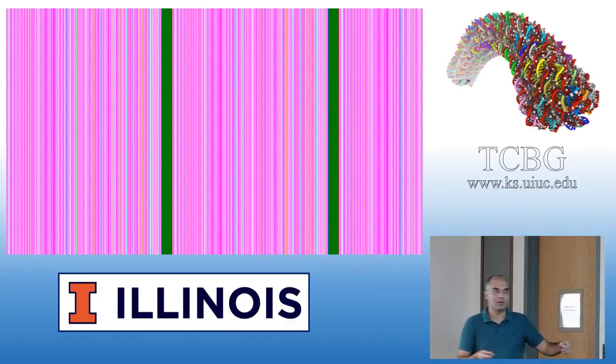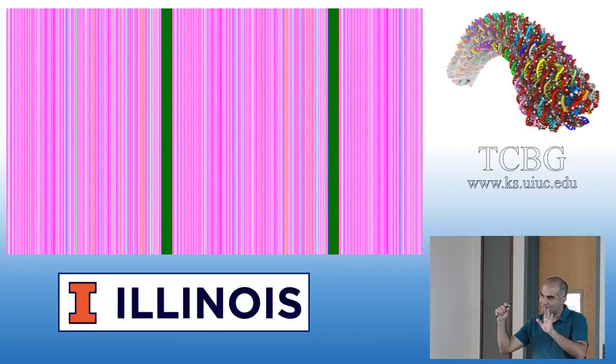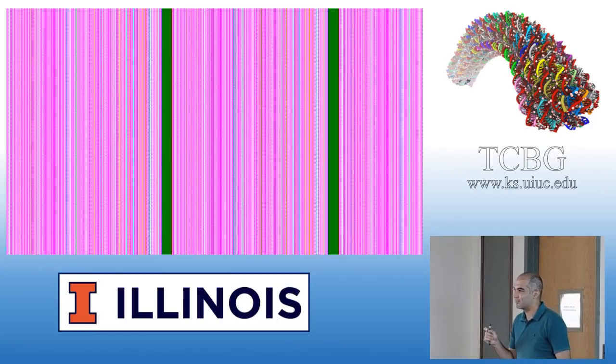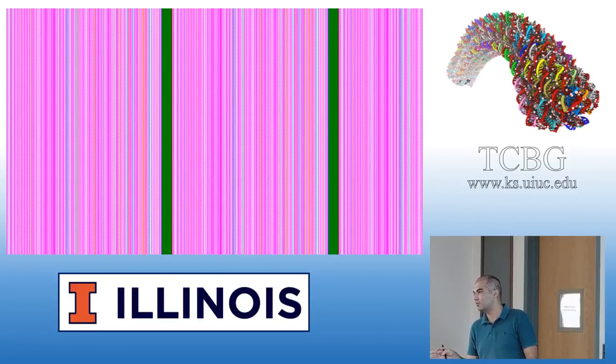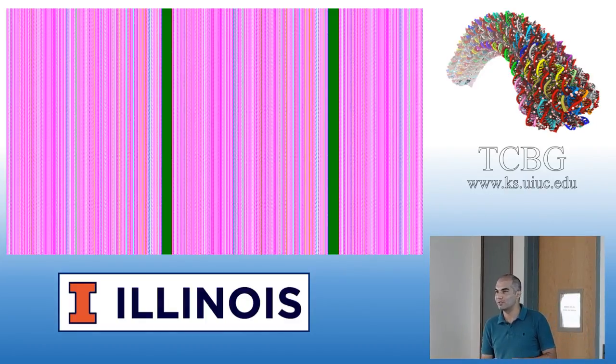So what I would do is make a design, use the auto break, and then if you have those special parts, add them later. And then do a simulation. The simulation would work fine with both file types, 2.5 and legacy JSON format. They're slightly different from each other, but it will work with the simulation for both of those.